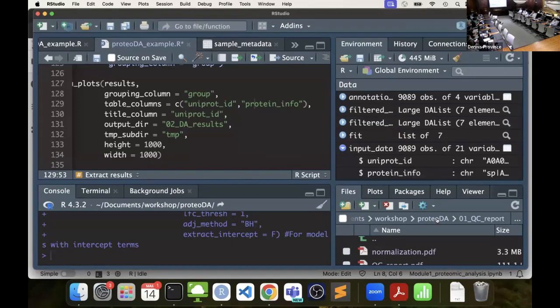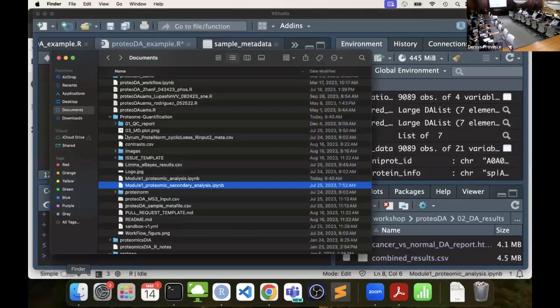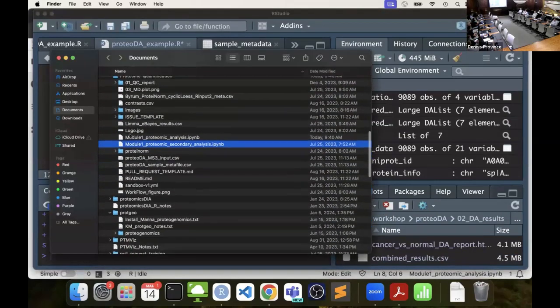All right, we're going to get there. Okay, DA results. So I'm going to go to my folder so it's easier to see.